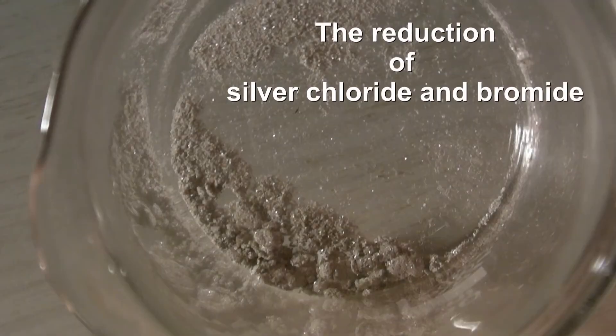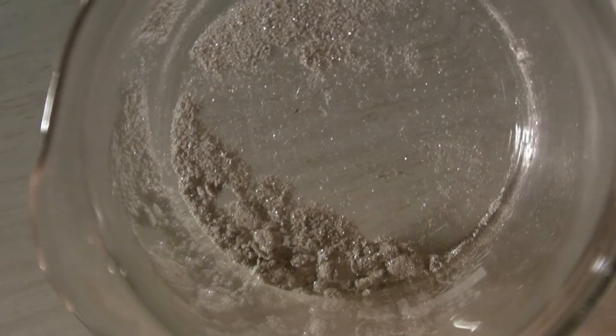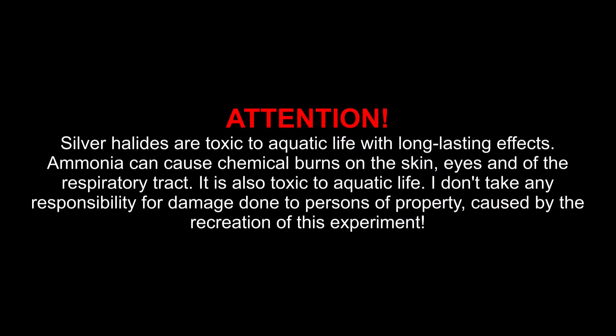The reduction of silver chloride and bromide. Silver halides are toxic to aquatic life with long-lasting effects. Ammonia can cause chemical burns on the skin, eyes, and of the respiratory tract. It is also toxic to aquatic life. I don't take any responsibility for damage done to persons or property caused by the recreation of this experiment.